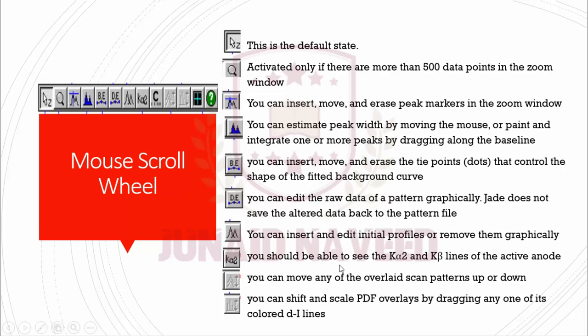With this button you will be able to see the K Alpha 2 and K Beta lines on the active anode. With this button you can move any of the overlay scan patterns up or down. With this button you can shift and scale PDF overlay by dragging any of its colored d-lines.